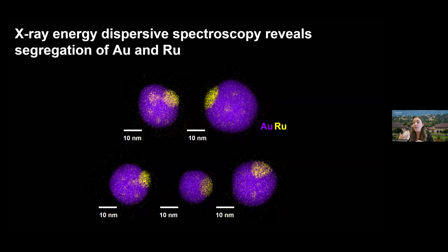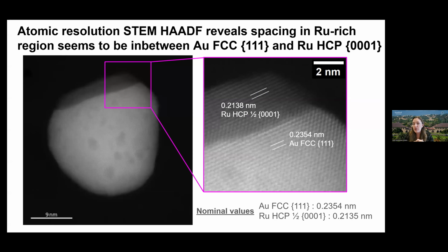Luckily, X-ray energy dispersive spectroscopy answered our question and revealed that these lighter contrast regions were ruthenium-rich regions, and that the particles had undergone a phase segregation, or a separation of our gold and ruthenium phases. High-resolution STEM HAADF helped us figure out that this ruthenium takes on a new phase. When they're in a solid solution, we have typically FCC crystals, but post-segregation, Ru takes on an HCP crystal structure.